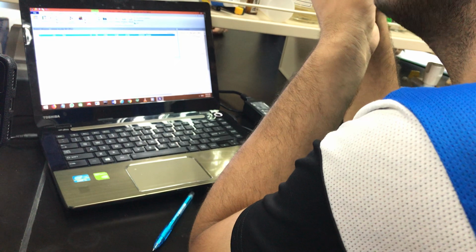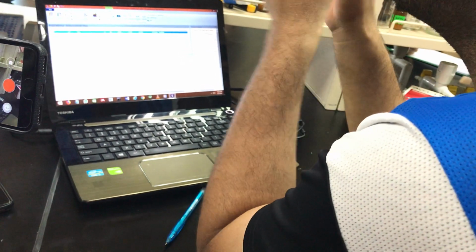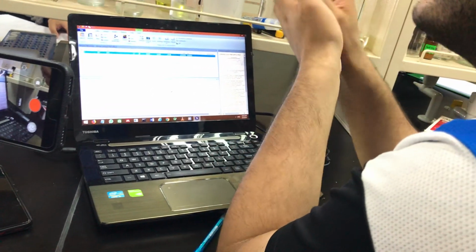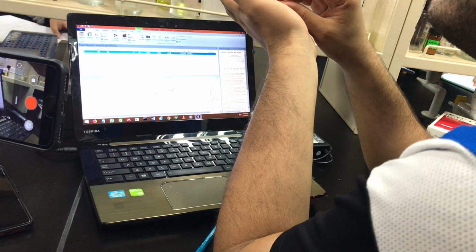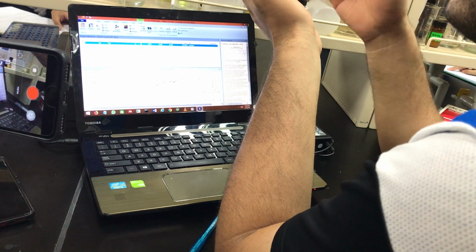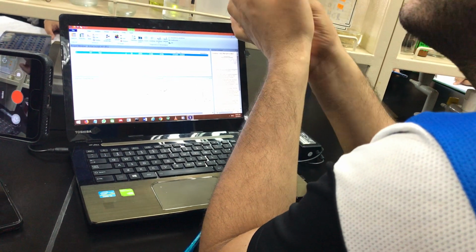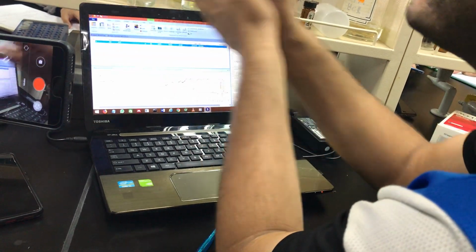That means all the activity is above 90%. If you use statistics to see the difference between all the extracts, there is no significant difference because all are in the same average, from 95 or above 95 to 100%. The software is not able to predict the difference because all are active. That's why you reject the data.